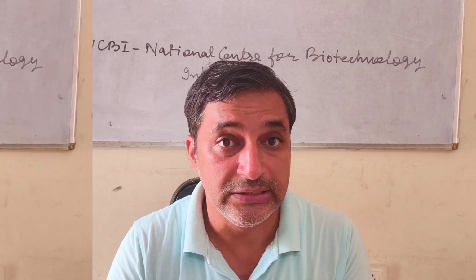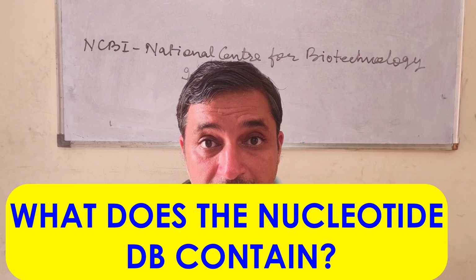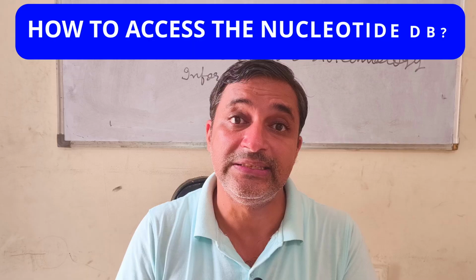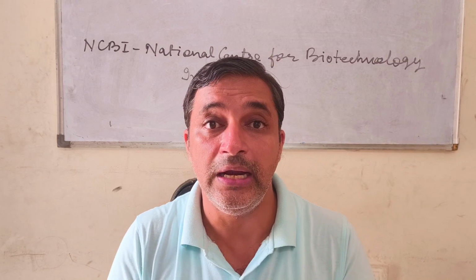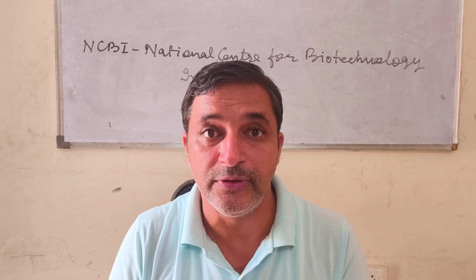We are going to discuss three major questions. First, what is the nucleotide database of NCBI? Second, what does it contain? And third, how to access this nucleotide database and how to use the information present in the nucleotide database of NCBI. Let's answer the first question.